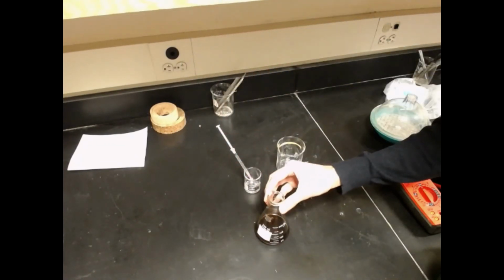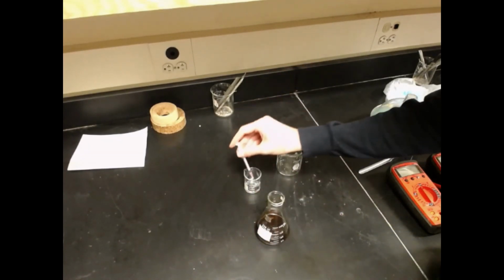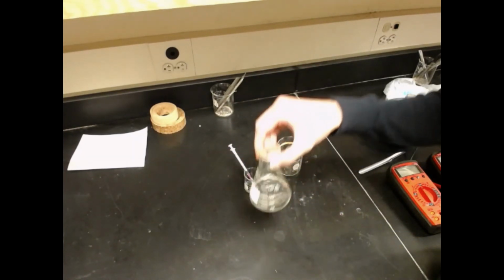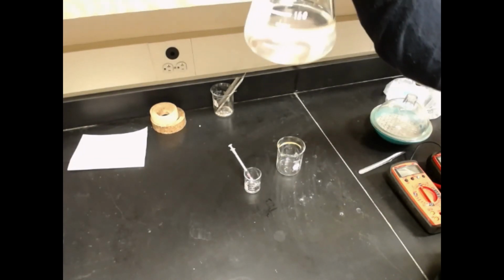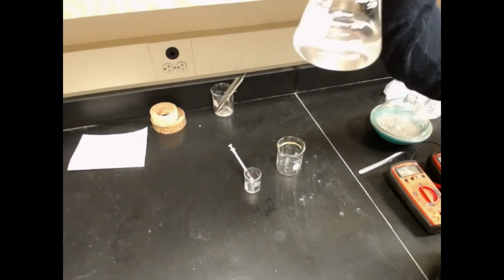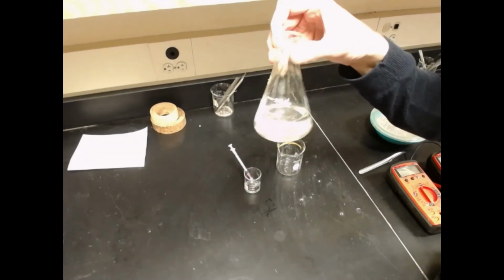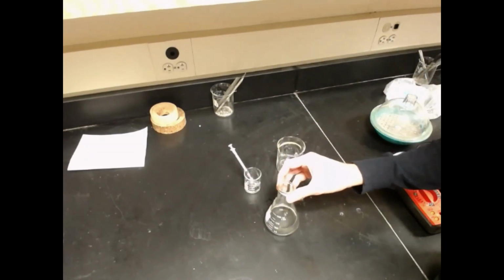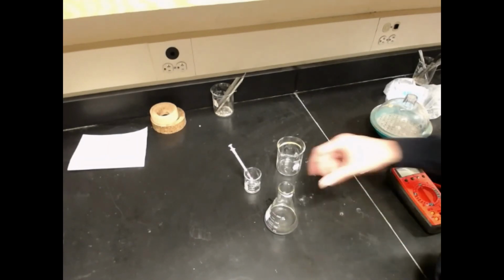Now if I add 1 milliliter of the thiosulfate and mix it around, you can see that the color disappears. If we wait about the same length of time as we waited the first time, we should see the color change again. It may be kind of hard to see. Let me try and get this in better focus, but you can see the solution has gone clear again because I added more thiosulfate. We'll just go until this is done for a second time. We won't repeat it the number of times you would in lab. In lab you would do this 5 times, but we're just going to do it twice.